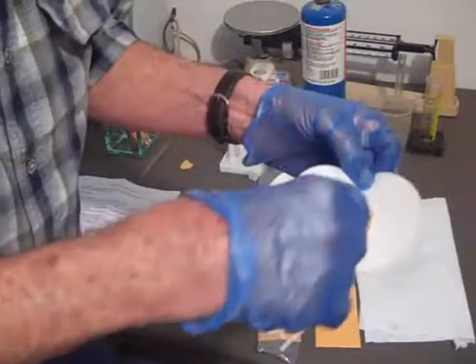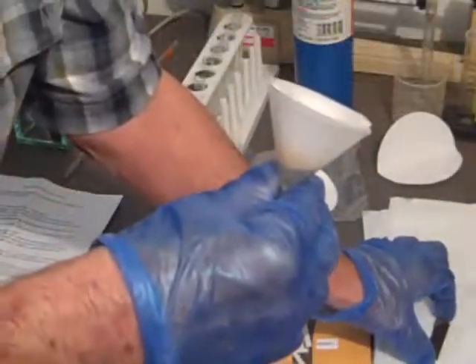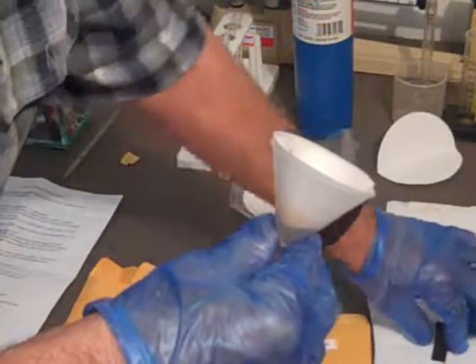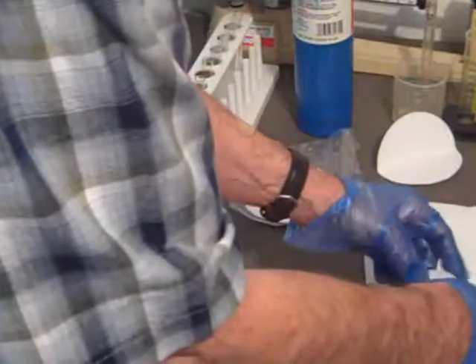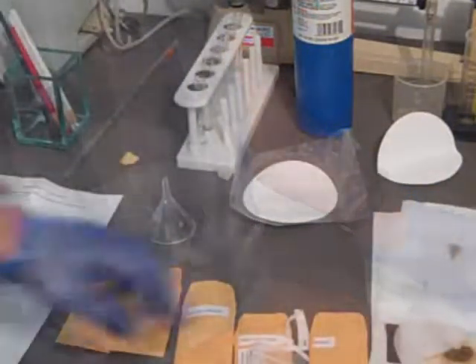The magnet is picking up the little pieces of iron filings. We've put that on a paper towel. Now we've mixed up the salt and sand mixture that's left and poured water through it. And we're pulling the filter paper out of the funnel, spreading it on the paper towel to dry.